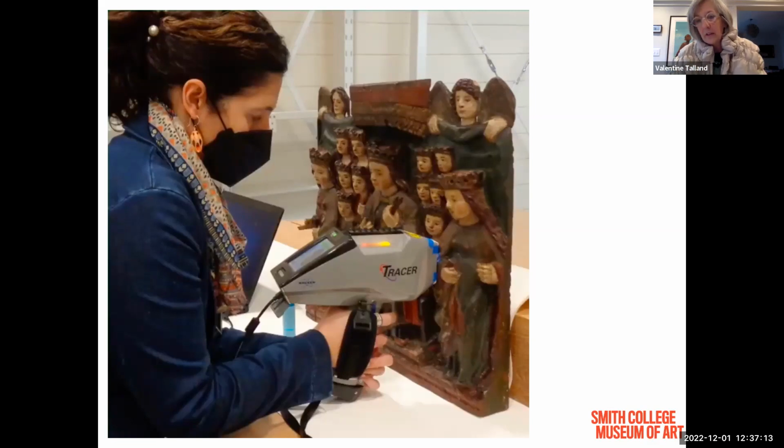What that tracer unit is doing, what XRF spectroscopy does, is emit energy, what we call radiant energy, in the X-ray spectrum. By comparison, visible light, the thing that we're using to see each other with now, is radiant energy in the visible light spectrum. But you can make choices. You can filter out light. If you think of a prism and how a prism shows you the rainbow, that's a form of filtration. And this tracer is a form of filtration in that it's selecting just energy in the X-ray range.